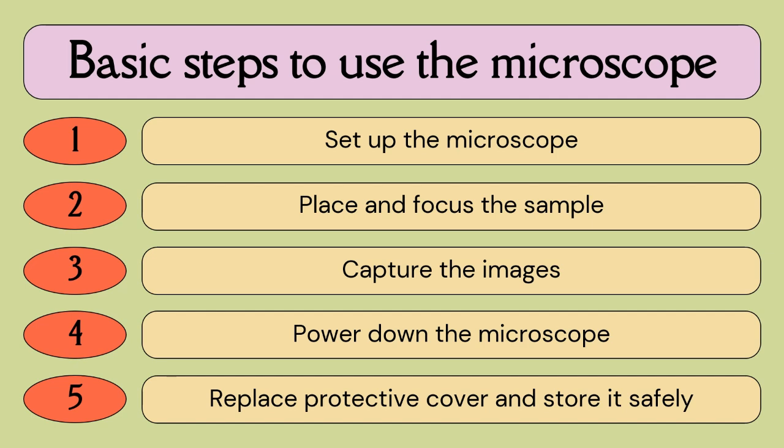So the basic steps to use the microscope begin with setting it up. Start by removing the protective cover and make sure the microscope is set on low power before plugging it in and switching it on. Then turn on the lamp and wait for about 15 minutes to ensure that illumination of your sample will be strong. Make sure you avoid looking at the lamp directly, as it releases very potent UV radiation, similarly to how you don't want to look directly at the sun. Switch on the motorized focus box on the microscope.